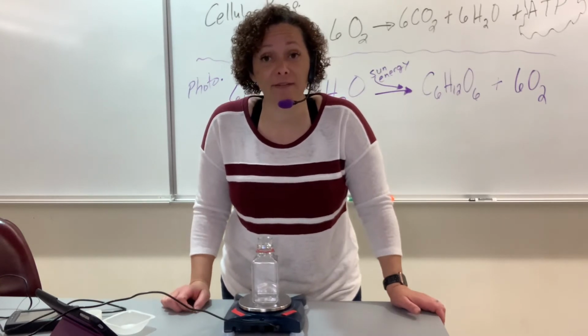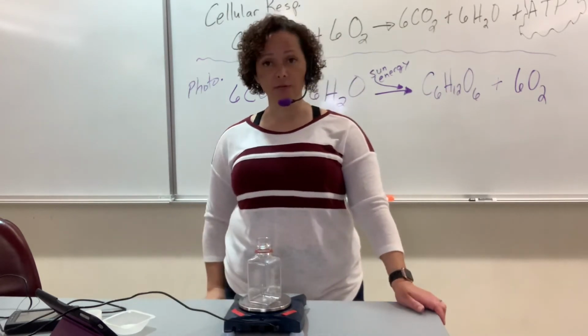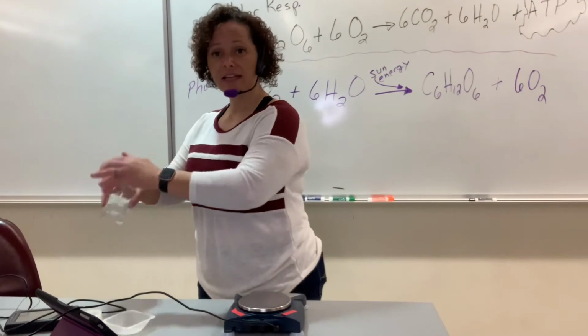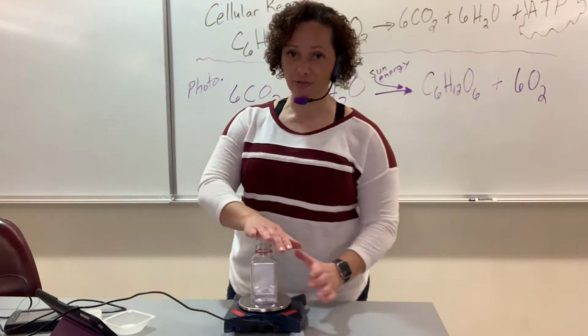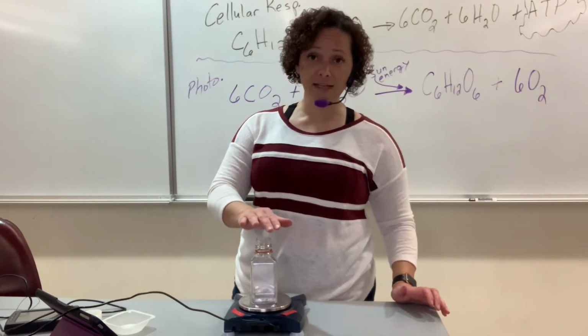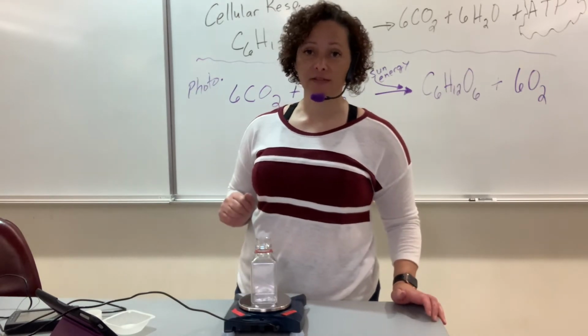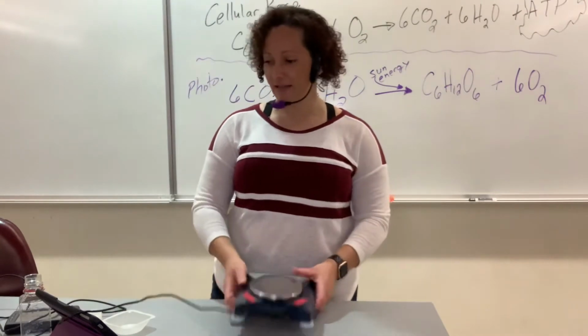So what you're going to have to probably do is get the mass of the chamber by itself, okay? Get your roaches and your crickets, get them in there. Try not to let them out. Try not to push on it. And then get the mass of them with them in there. And then you calculate the difference. So I'll let you work that out. It's real fun. All right.